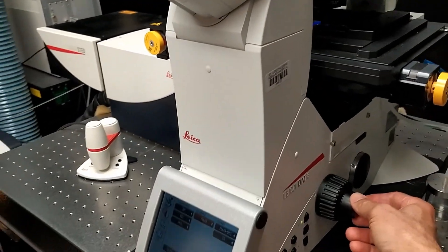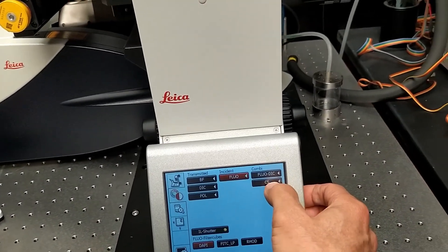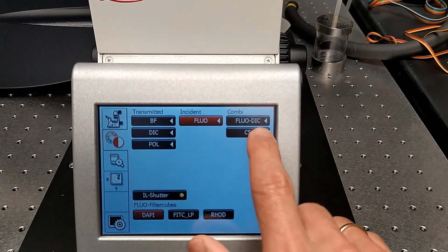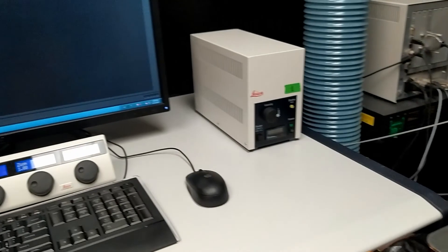Adjust the Z position and focus to the sample. Once it's done, press the CS button, which stands for confocal scanning. Then you can proceed to set up the acquisition in the software.